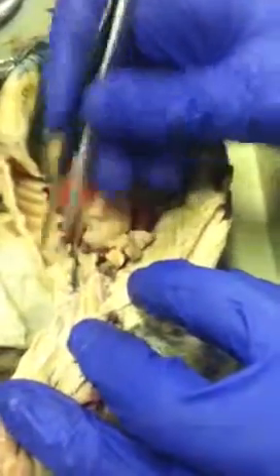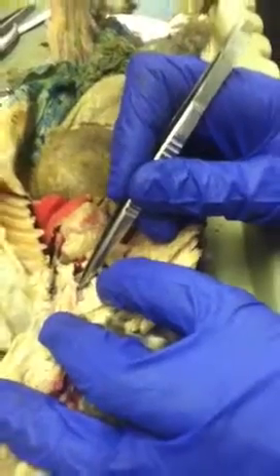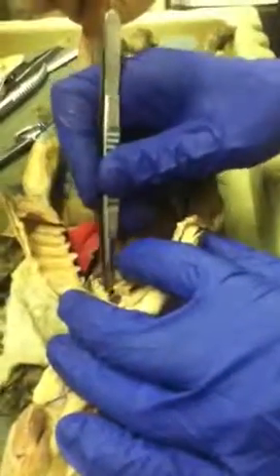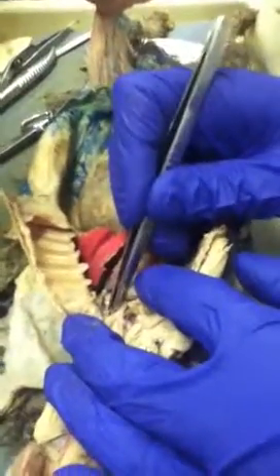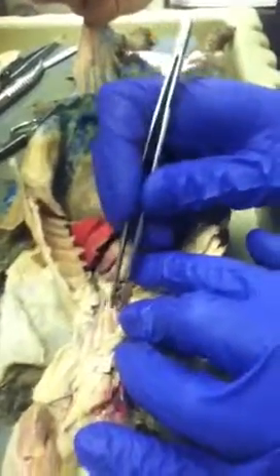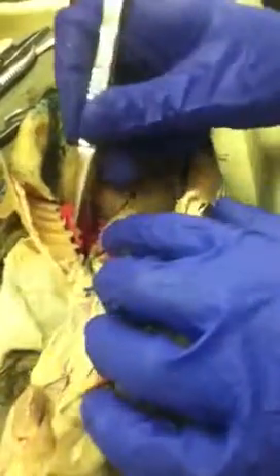There's the left common carotid, called common because it's going to branch into external and internal. Here's the right common carotid, and just as in the pig, the right side gives rise to the right subclavian. Where does the left subclavian come from? On the brachiocephalic. From the arch, actually. And what do you know? There it is, coming off on its own, just like it did in the pig. So we have the aortic arch, brachiocephalic trunk, left and right common carotid. A branch off the right is the right subclavian, and a branch from the aortic arch is the left subclavian. And then the arch turns around to become the dorsal aorta.